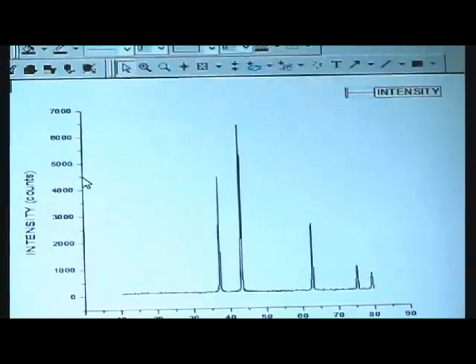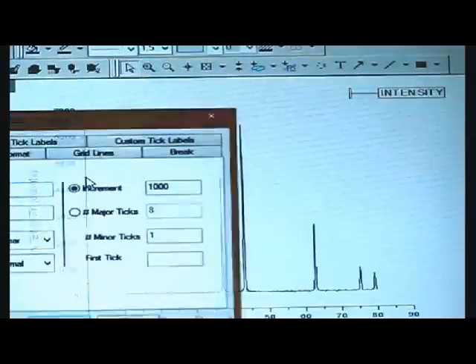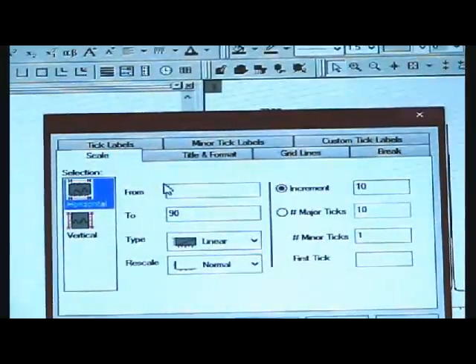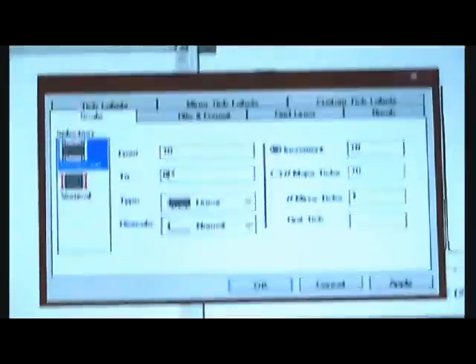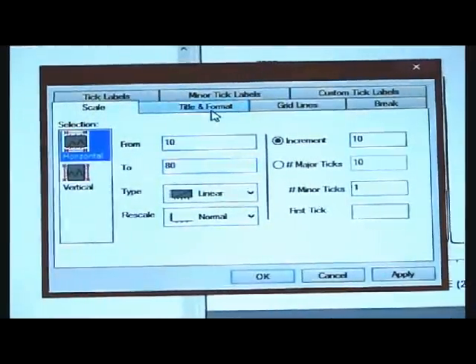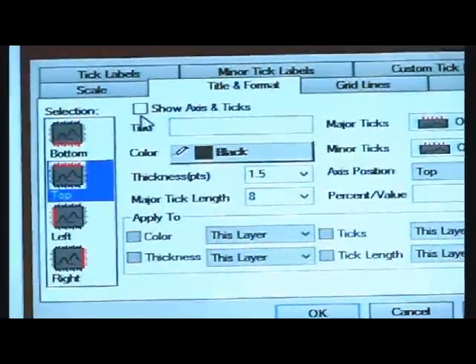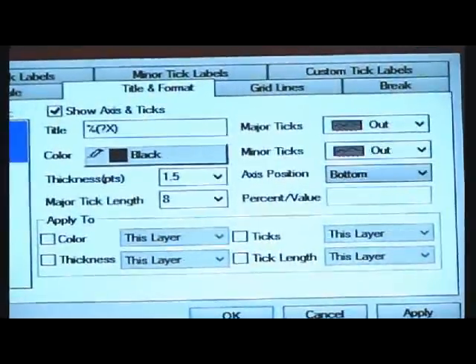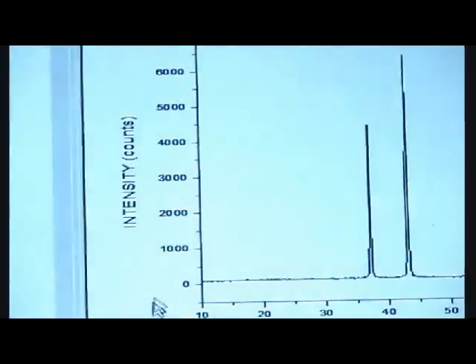We can display it in a better way. For this, double click on the vertical bar and change the horizontal scale from 10 to 80. And also click on the title and format icon. Now mark the top axis and the right axis. The bottom and the left axis are also shown. So now click on OK. We get it in a better way.